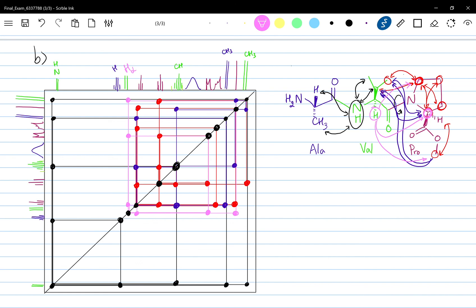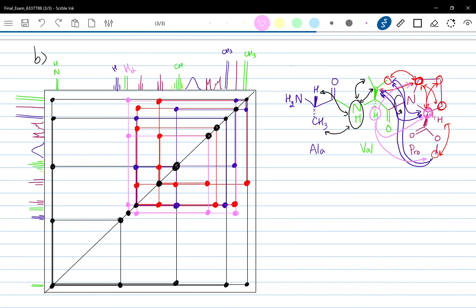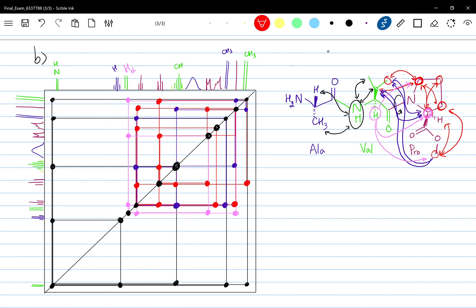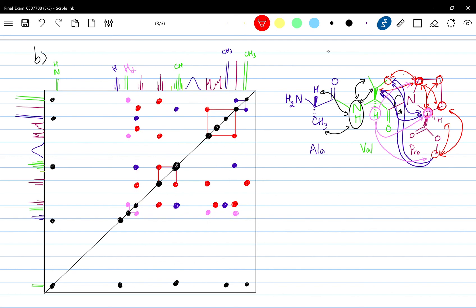I have one last interaction, which is from this methyl to this methylene. From that methyl — which is this one — to that specific peak, you'll get these interactions also. And that's it for today. This is my interpretation of the tripeptide alanine, valine, and proline. Hope you enjoyed that. Thanks.